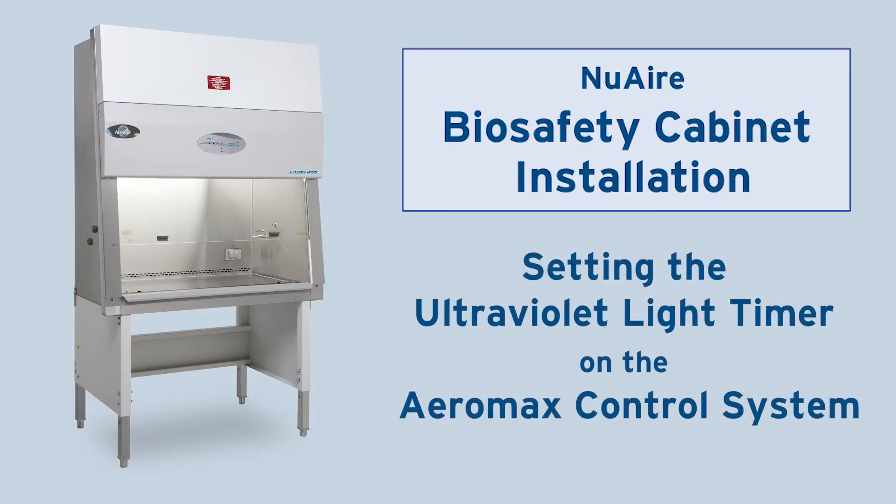This video will show you how to program the UV light to turn off automatically after a preset time.